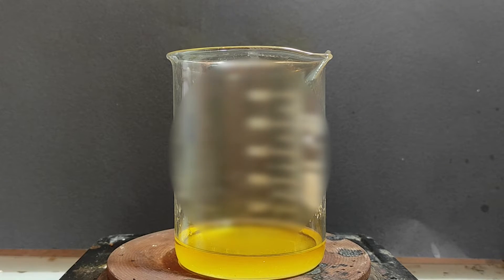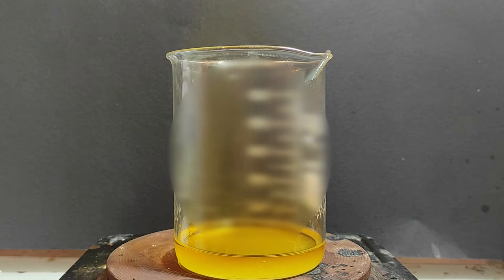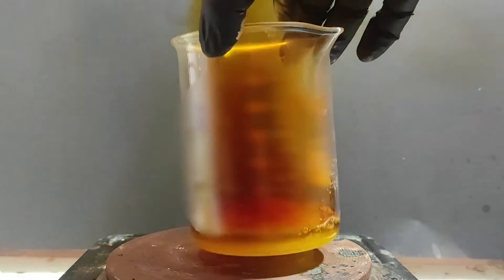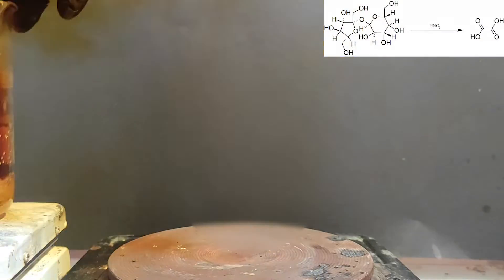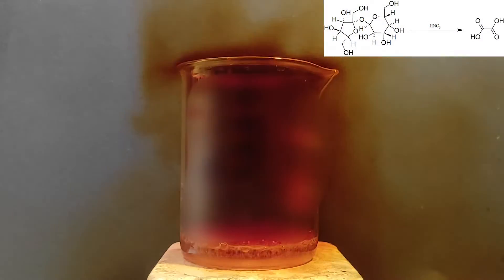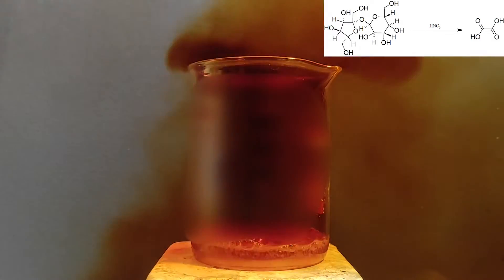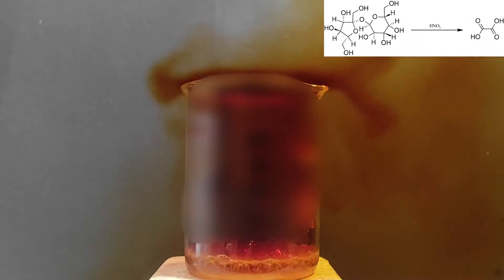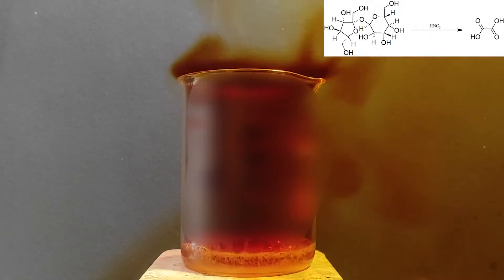Once it passed a certain temperature the sucrose in the table sugar was broken down by the acid and then the resulting glucose and fructose are broken down further into oxalic acid. This oxalic acid is quite impure but it doesn't matter because oxalic acid can be impure and the reaction will work anyway.